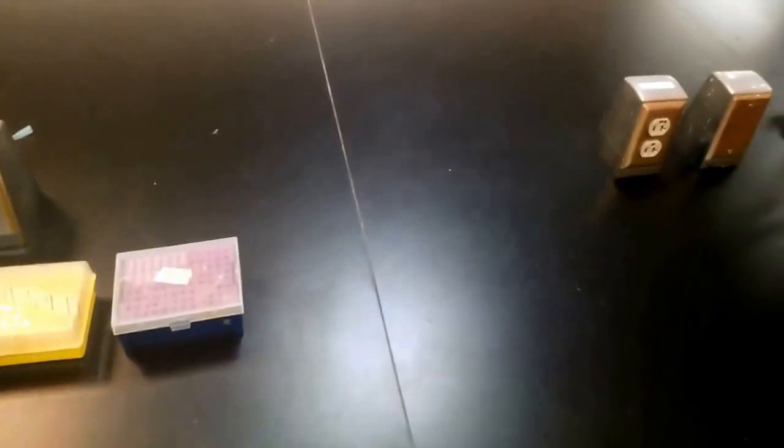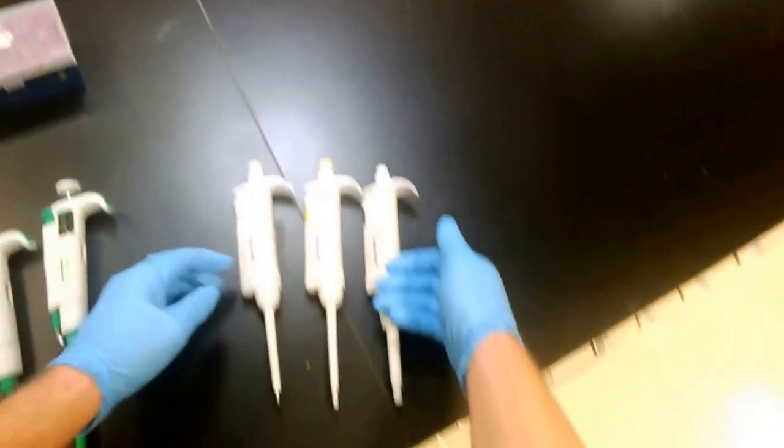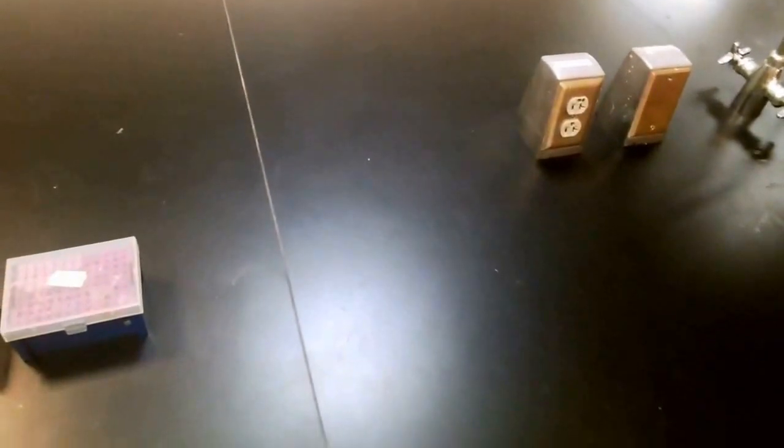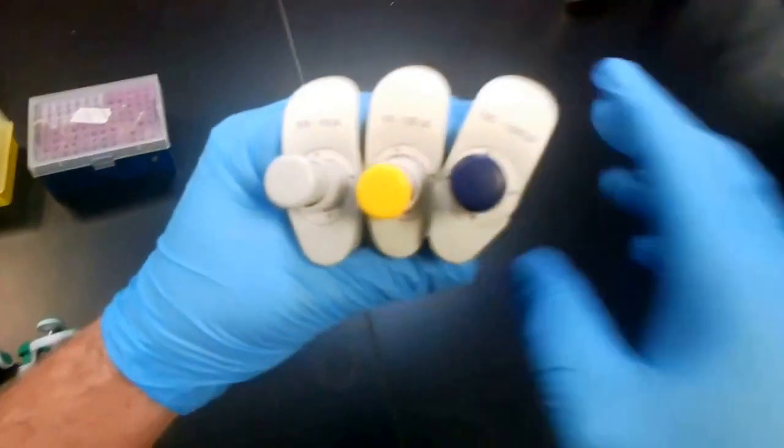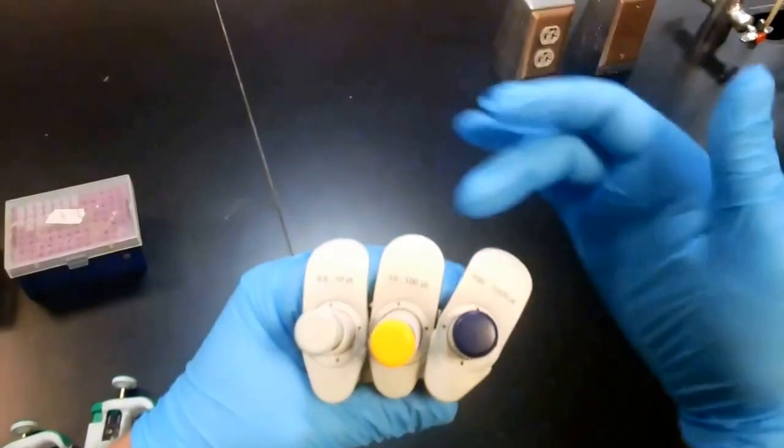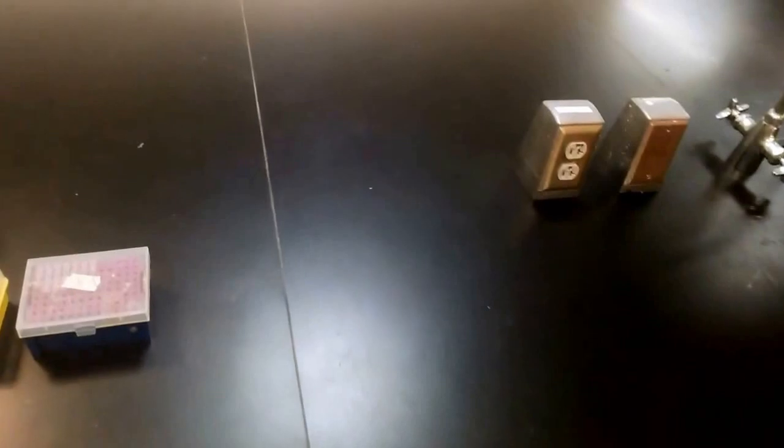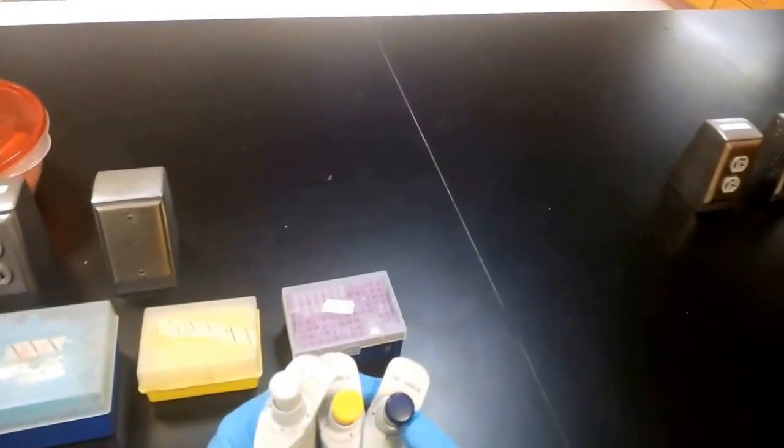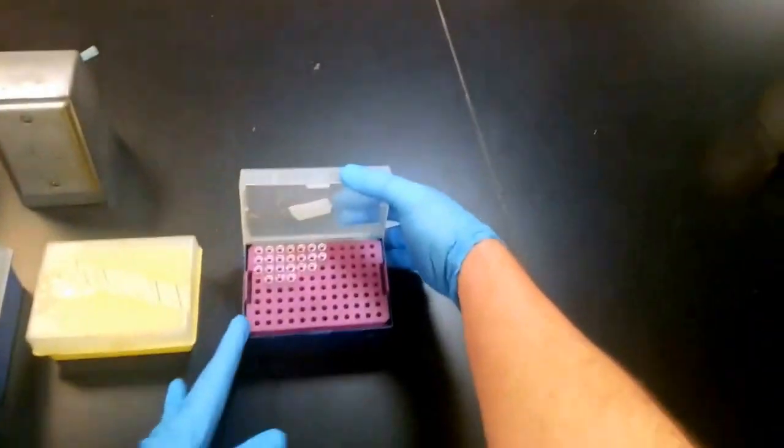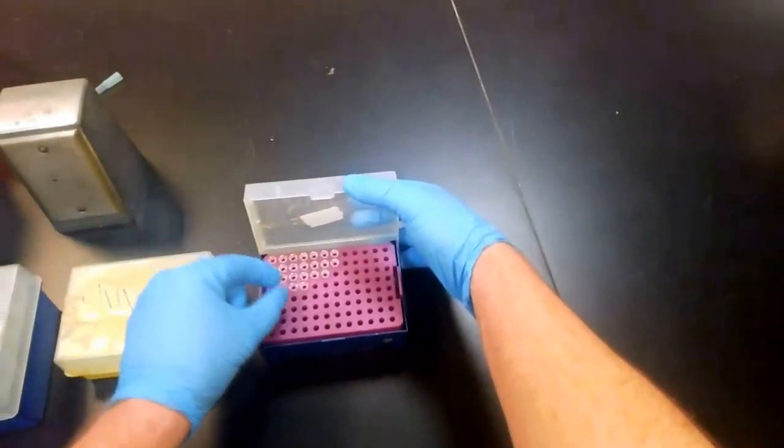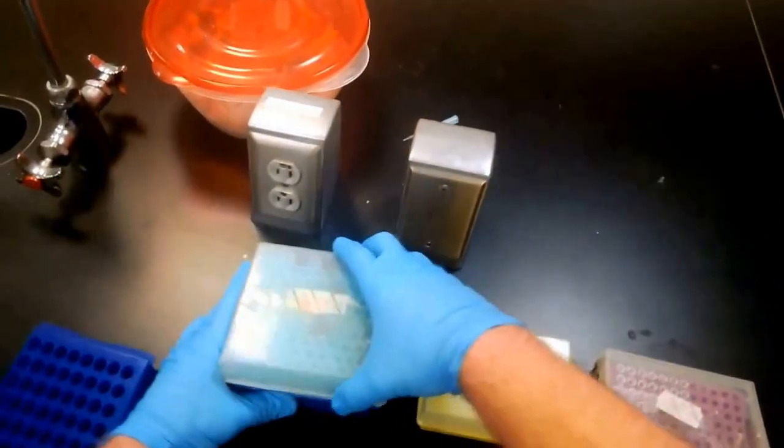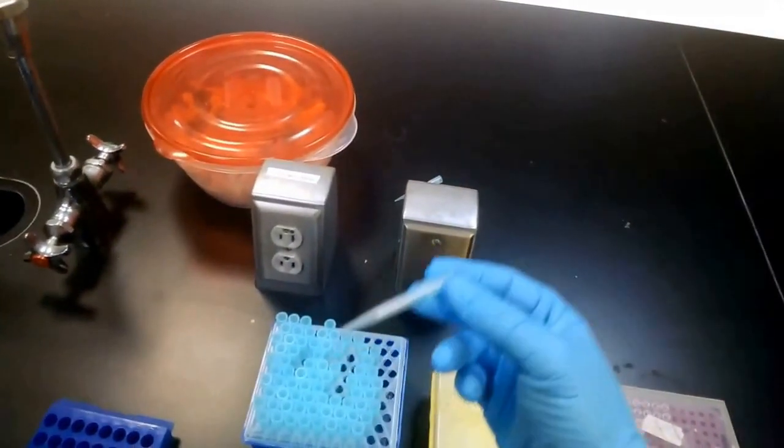On the Eppendorf side they're labeled 100 to 1000 microliters, and if we look at the scale here on the top, we've got 100 to 1000, 10 to 100, and 0.5 to 10. The colors on the analog scale here and on the buttons correspond to the colors of our tips. For 0.5 to 10 we have white tips, for 10 to 100 yellow tips, and from 100 to 1000 blue tips.